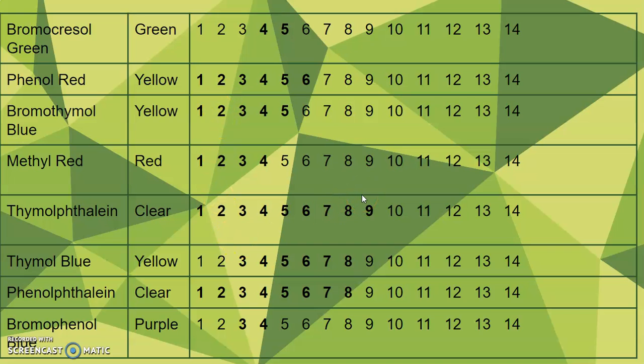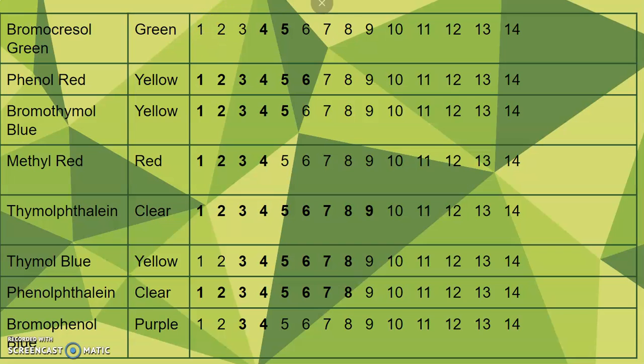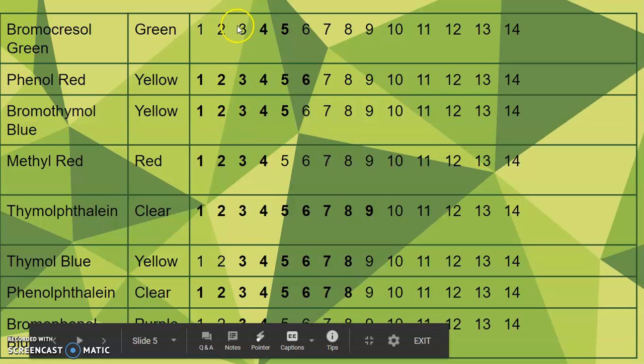What I want to do is go through all the potential pH units and see if there are any numbers I can eliminate because one of the indicators did not show that value. If we look at the ones, this first one is not bolded, and some of these are and some of these aren't. So that means it's not possible that my solution is a pH of 1, because otherwise my bromocresol green would have shown that as well. I'll do the same for pH of 2. You can see that some of the pHs of 2 as we go down are not bolded, so I knock that one out. Repeating with 3, some aren't bold, and look, all of them are bold except for this first one, so bromocresol green here is telling me it's not a pH of 3.